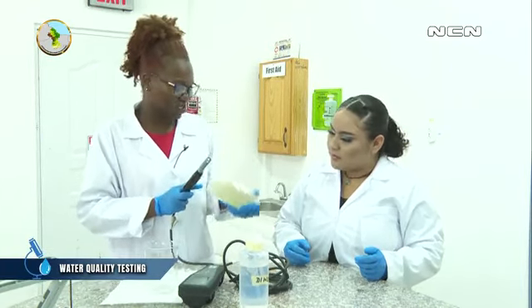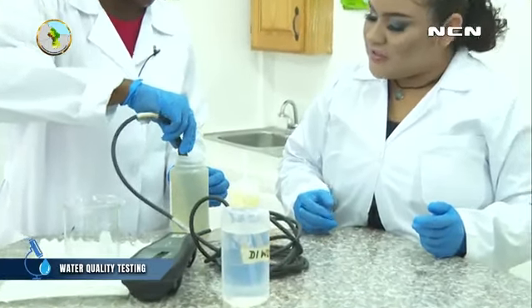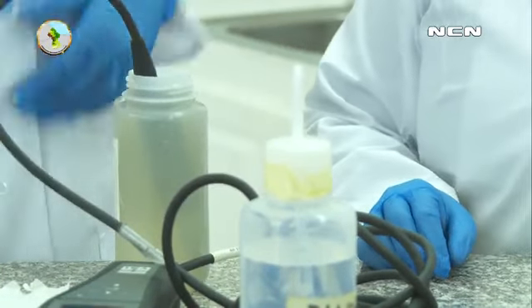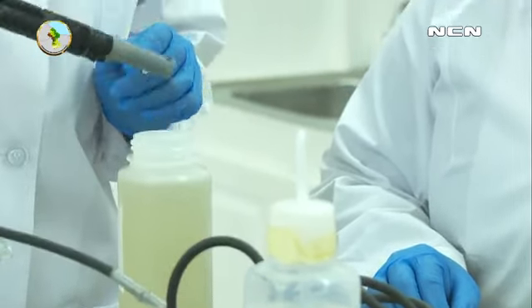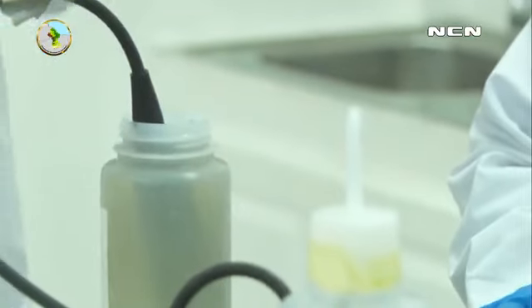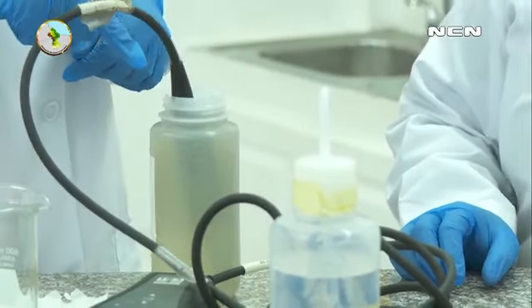So again, ensure that your sample is thoroughly mixed. Does this take water in, or does it just need to be on the outer surface? It just needs to be on the outer surface. This meter doesn't take in any water. There are probes right at the bottom. Let's take it out once again. You see that at the bottom here, there's a bulb. That bulb is what's actually taking the reading of the water. But because the probe is a complete unit, you have to ensure all parts are covered to get a proper reading. That's why you must always cover the top with the water sample.